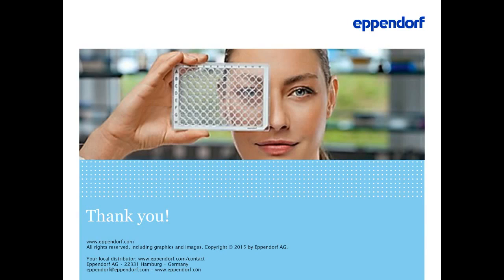Okay. The next person thanks you again and says, I have a question of whether you perform some experiments or assays about leaching of additives before marketing your products. And do you think we must ask our suppliers about such assays before we purchase plasticware? Yes, we routinely perform quality tests. First of all, we start with the product specification, and of course, for all of the consumables, there is no critical additive. But yet, we do test general leaching of all of the organic substances, so we routinely perform such tests. And I do recommend that you ask your supplier how they address this topic, if they test it, if they certify it, and what their statement on this is.